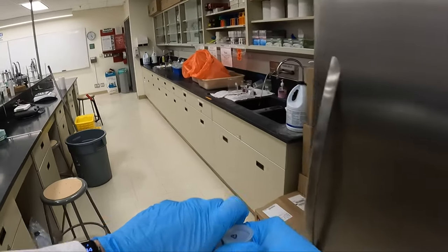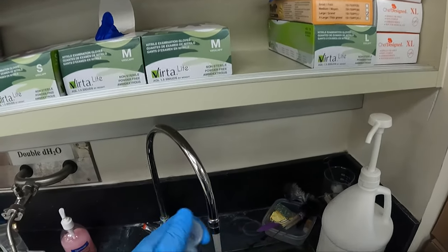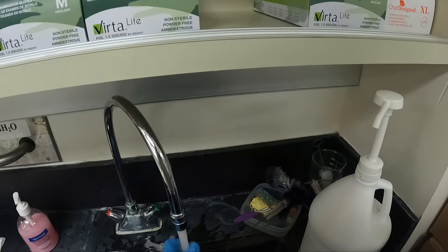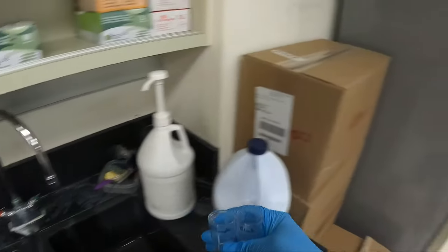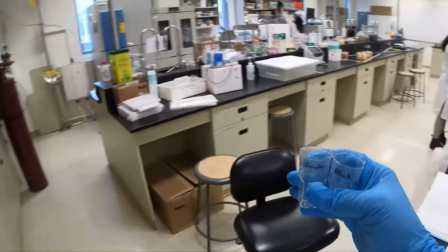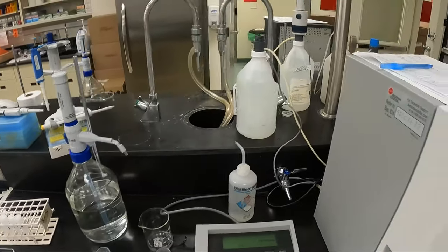I'll then take this over to the sink. There's a very small volume of cells in here. I'm just going to rinse it out with some water. Rinse the caps as well. I'm going to use these again for my second counts after my serial dilution. So I'll leave them open to dry slightly.